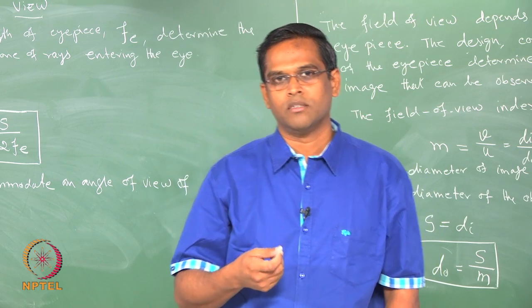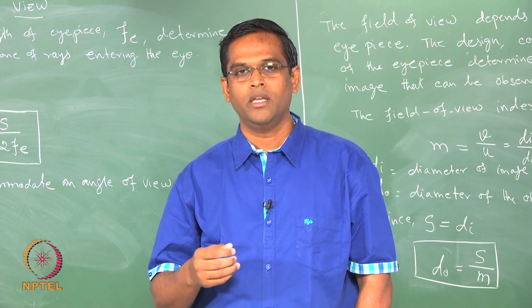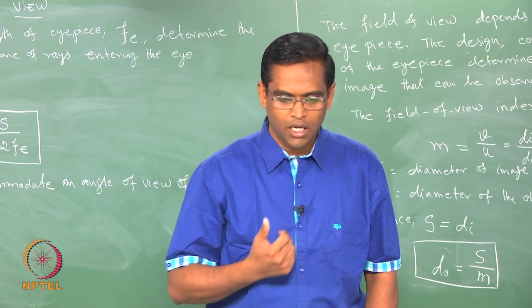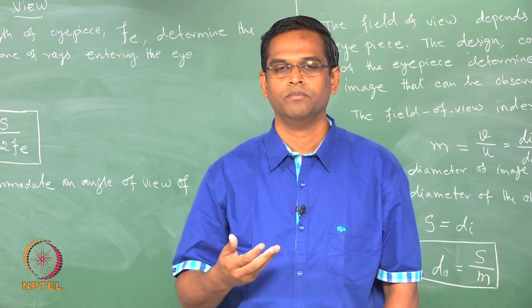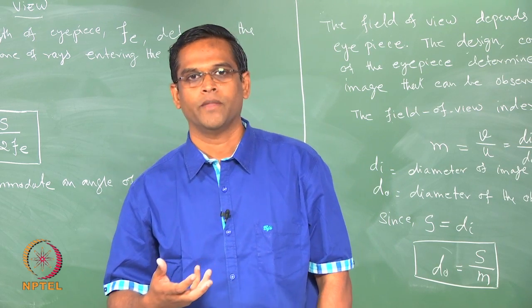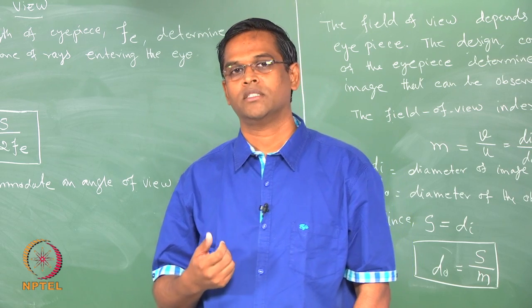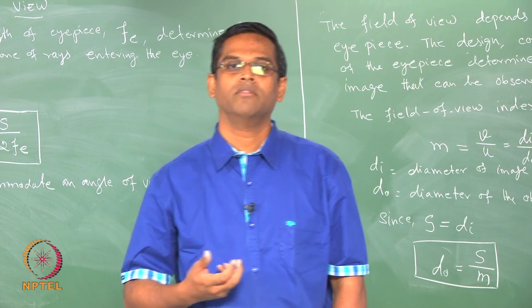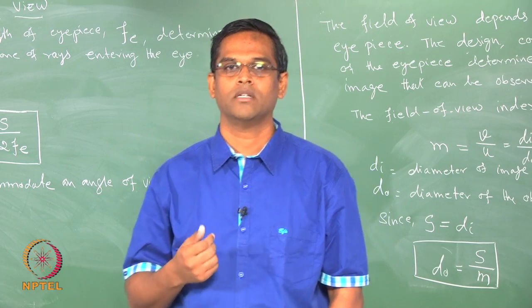We will talk about this contrast much more when we progress in the image analysis in the later part of it. For the time being, I just want you to remember this basic definition. Now we will talk about lens defects. All the time we talked about an objective lens and an eyepiece and their characteristics and light gathering power and so on. All this light gathering power, which has complete control of image quality, also depends upon the defects of the lens. So let us first look at what the lens defects are in general, and then we will see how each defect can be corrected for a better quality image.